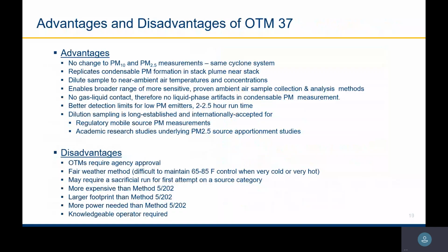The other issue we ran into is that it's a little more of a fair weather method. Because you have to maintain that chamber at 65 to 85 degrees, and it's a rather large piece of metal, if it's a really, really hot day, you have to really cool that incoming air. The inlet air needs to be refrigerated. We ended up running it through a bunch of intercoolers, and we even ran a portable air conditioner at one point to get that air as cool as possible.